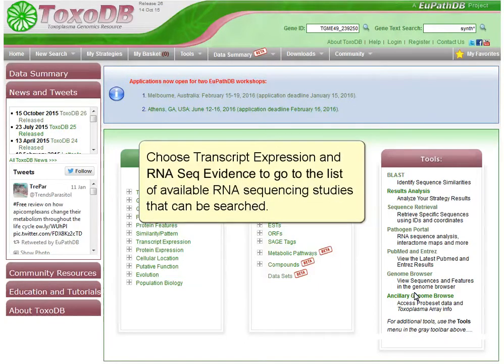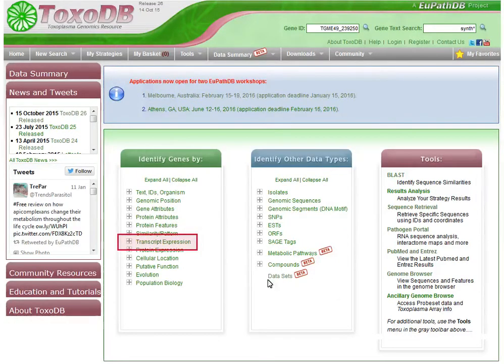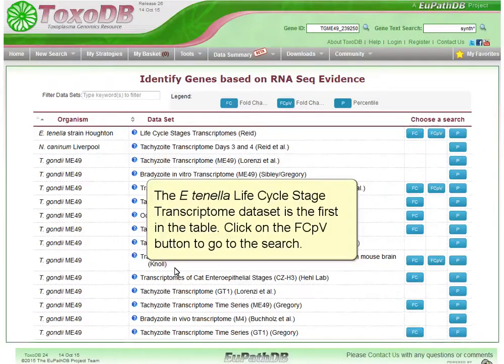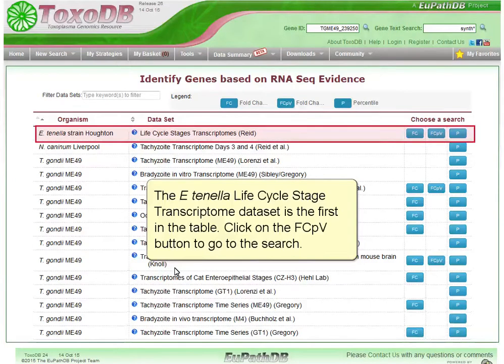Choose Transcript Expression and RNA-seq evidence to go to the list of available RNA sequencing studies that can be searched. The E. tenella lifecycle stage transcriptome dataset is the first in the table. Click on the FCPV button to go to the search.